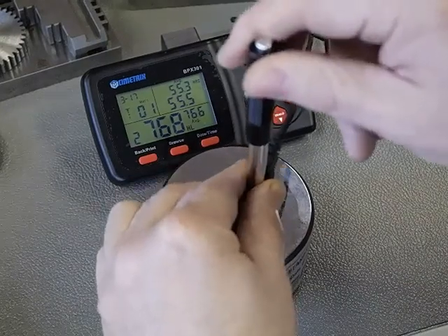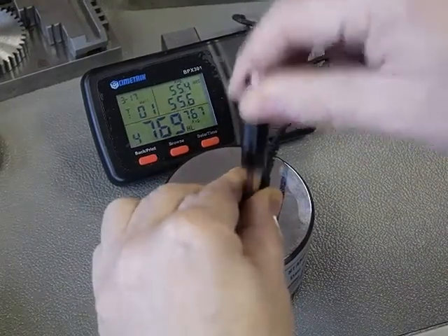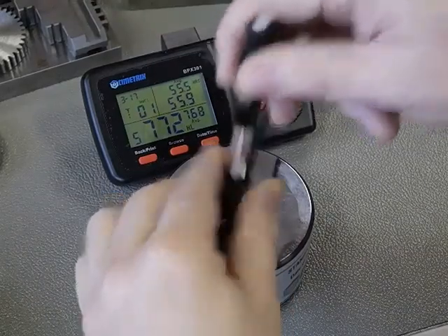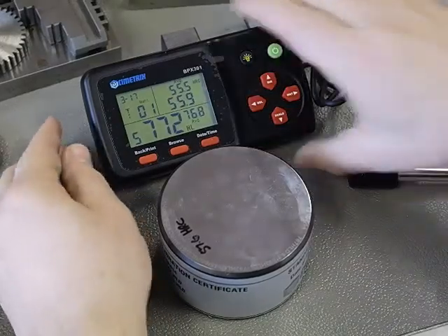So we're going to do 5 tests on this block: 1, 2, 3, 4, 5. You have to do an exact number. We're doing an average here and the average is 768.